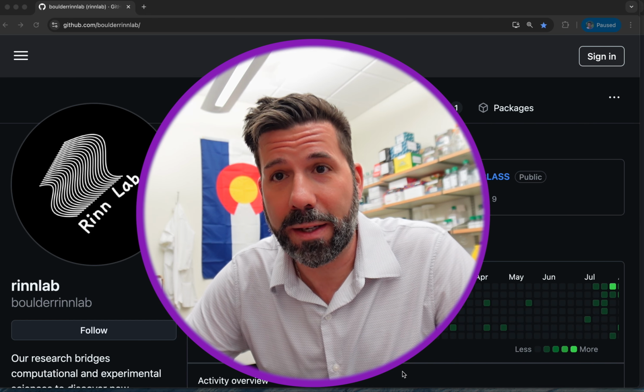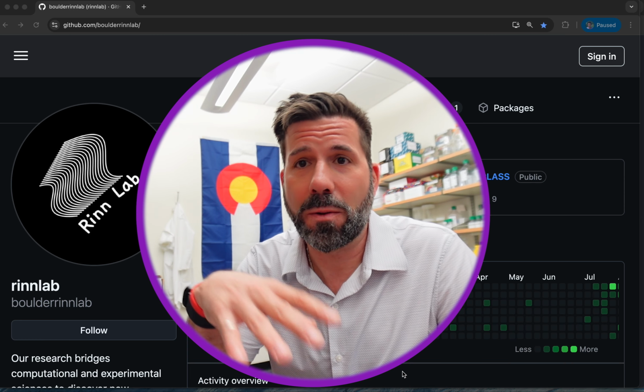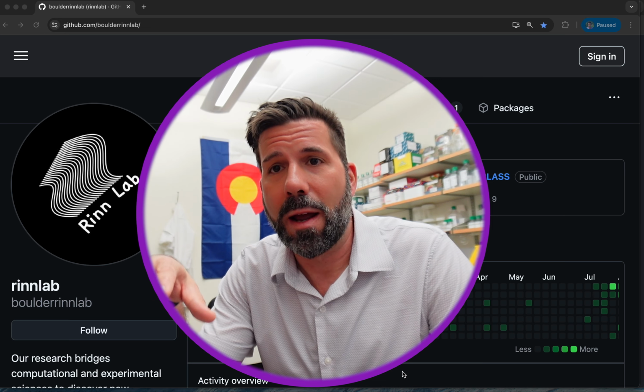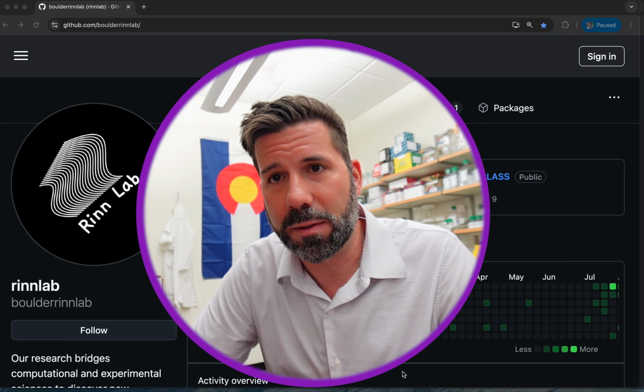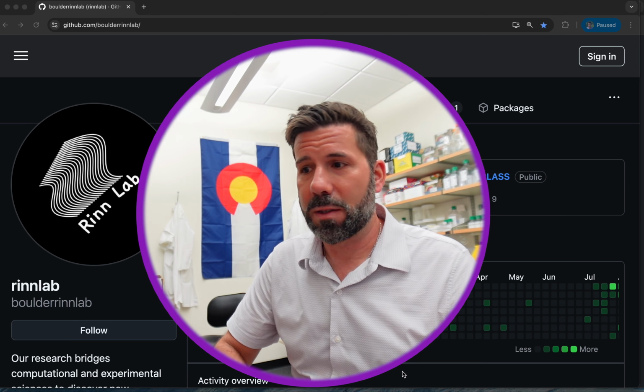Hello, welcome back to the Computational Genomics Lab. Today we are going to be making the last step for DESeq, which is the sample sheet. We made the counts table last time to get the counts ready for DESeq input, and now we need to tell DESeq what samples are what and what statistical analysis to do comparing which samples. Alright, so let's get started here.